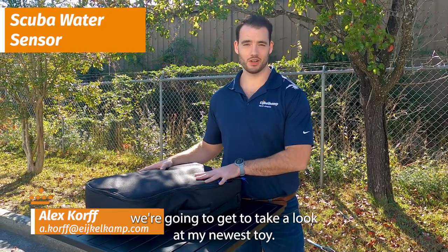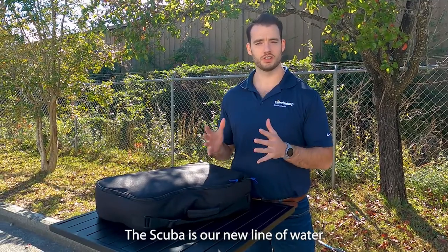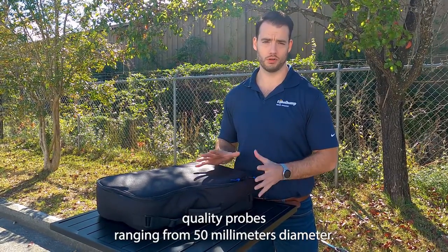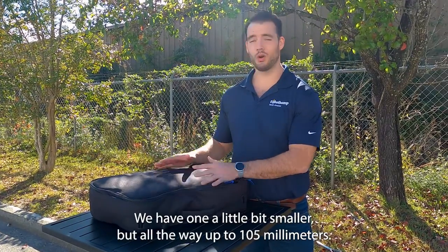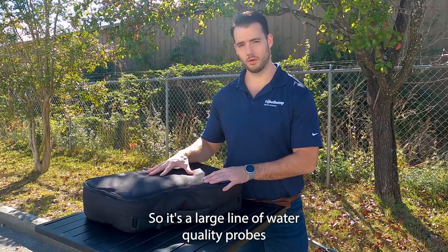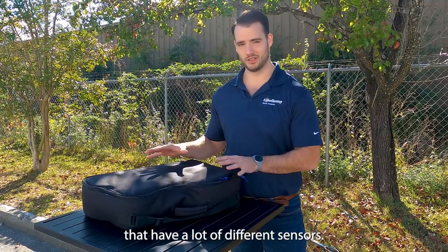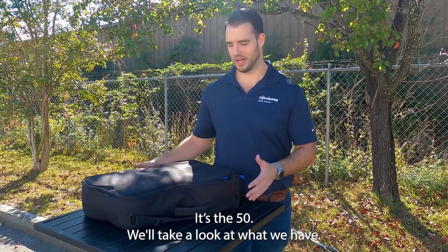Hi, this is Alex with Eijkelkamp and today we're going to take a look at my newest toy. This is the Scuba 50. The Scuba is our new line of water quality probes ranging from 50 millimeters diameter. We have one a little bit smaller, but all the way up to 105 millimeters — a large line of water quality probes with a lot of different sensors. This one just came in.